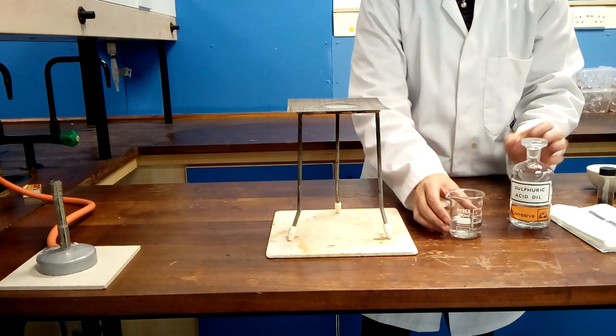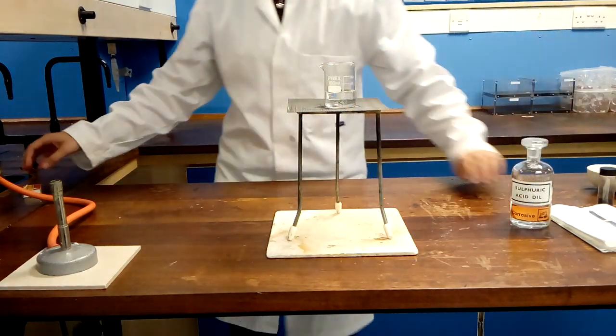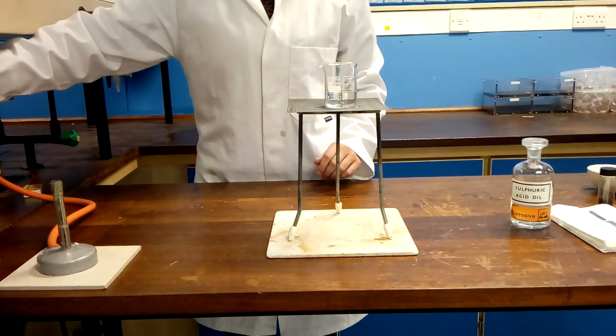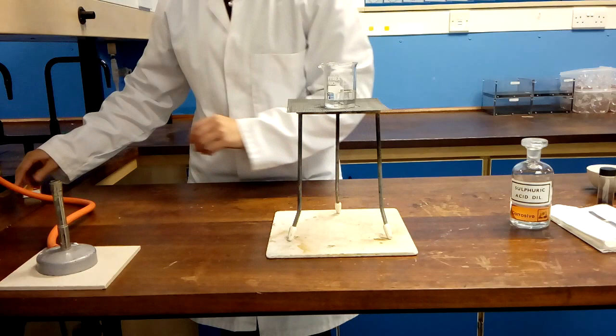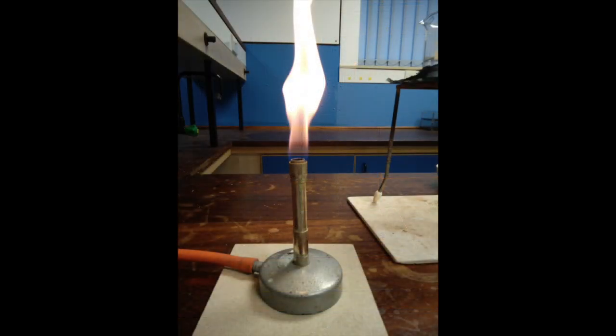The acid needs to be heated using a Bunsen before we add the copper oxide. Set up the heatproof mat, tripod and gauze and place your beaker of acid on top. Before you light the Bunsen you must make sure that it is set to the safety flame. This means that the collar must be closed. Here you can see a closed collar and an orange safety flame.